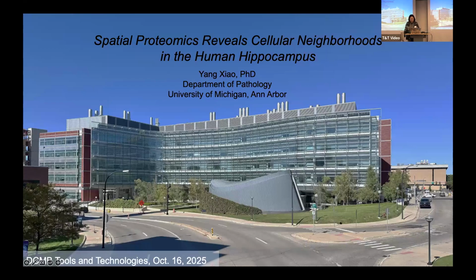We're a lab focusing on spatial systems biology, looking at all types of RNA, protein, and epigenome biology with spatial coordinates. The topic I'm going to present today is spatial proteomics.